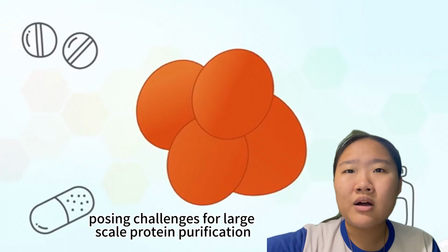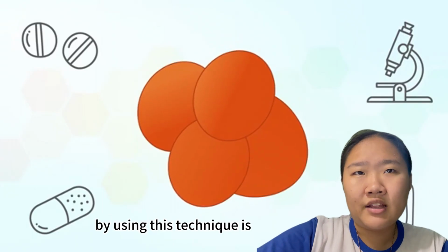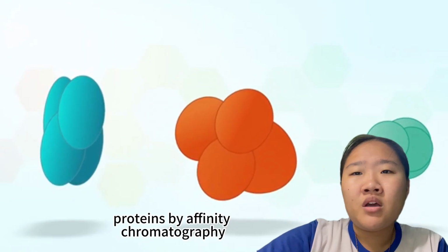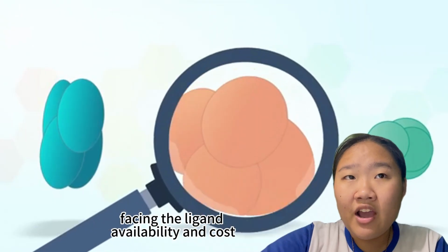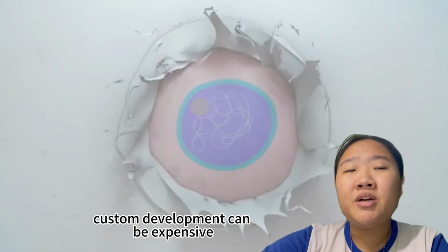for large-scale protein purification. An example of challenges faced before by using this technique is challenges in the purification of recombinant tagged proteins by affinity chromatography. The cases are like facing ligand availability and cost, where specific affinity ligands may not be available for all target proteins, and custom development can be expensive.